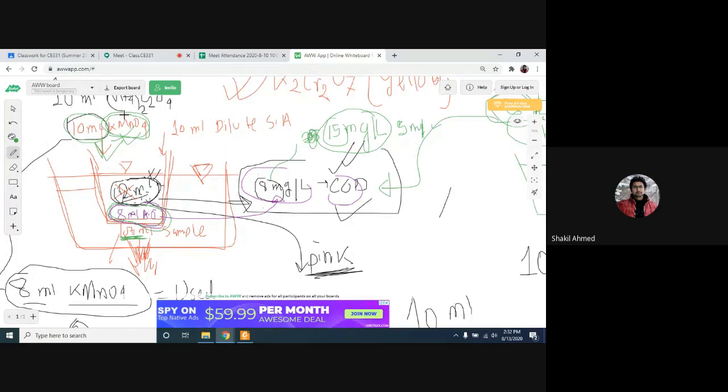Are you following me? Yes, sir. So if you see that after addition of 10 ml of potassium permanganate at the very beginning, the pink color goes away, that means your strength of COD is very high. Then what you do? You dilute your sample, and then you do the test again.